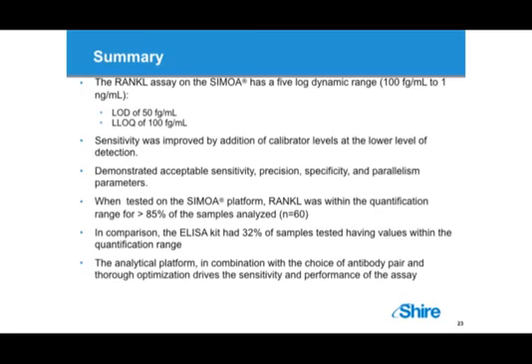And one important point I want to make is that the analytical platform in combination with the choice of antibody pair dictates the sensitivity and the performance of the assay, not just the antibody pair. So we also need the platform.